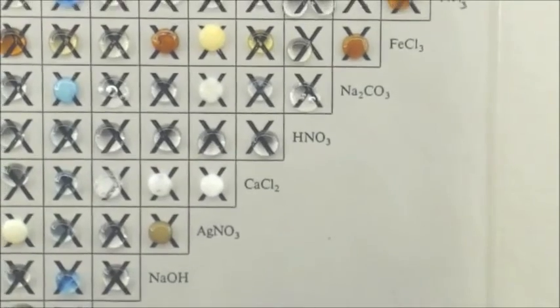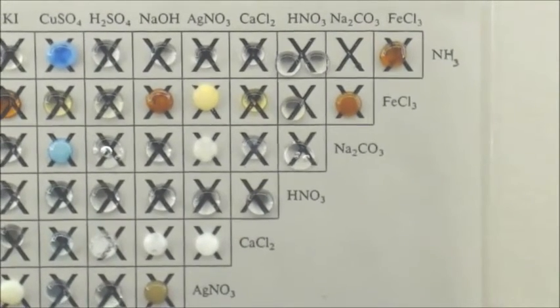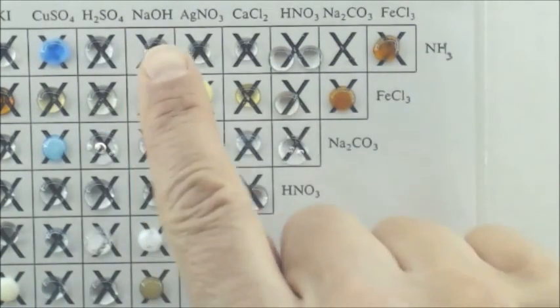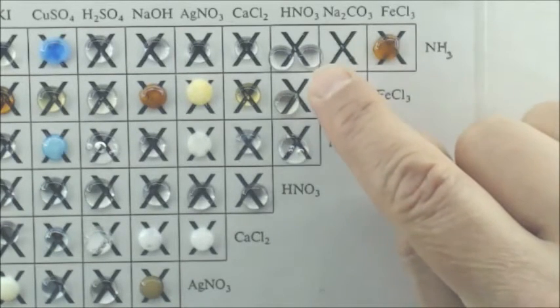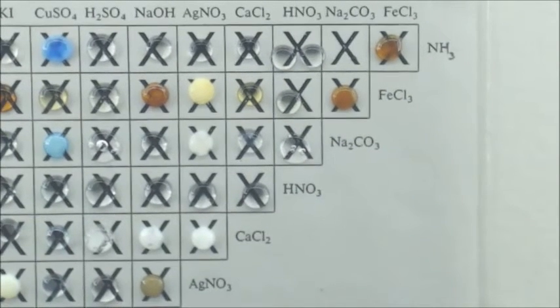And then in the upper corner up here, remember the first close-up I gave you came out to H2SO4, so here's the last 6 rows. There's kind of that reddish brown precipitate that forms. These shifted a little bit. That no reaction belongs there, that no reaction belongs there, but they're both no reactions.